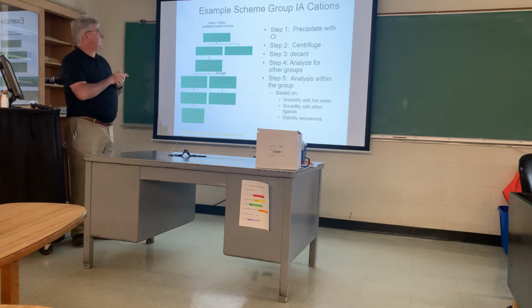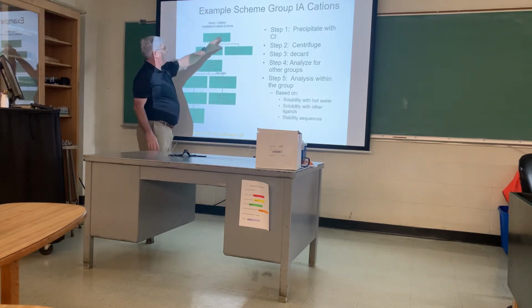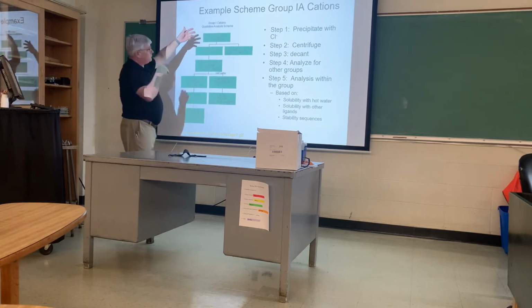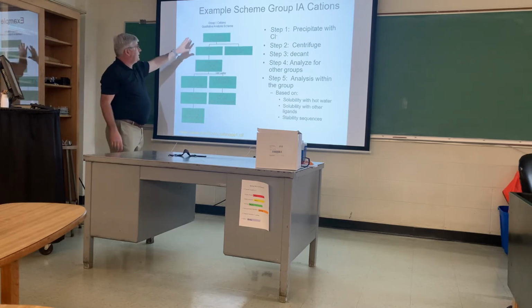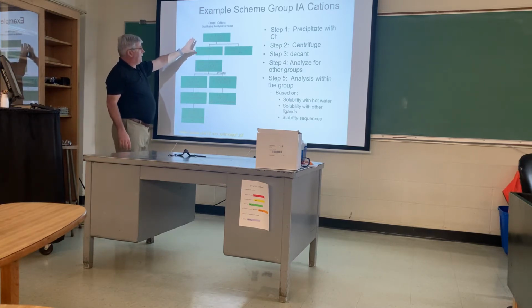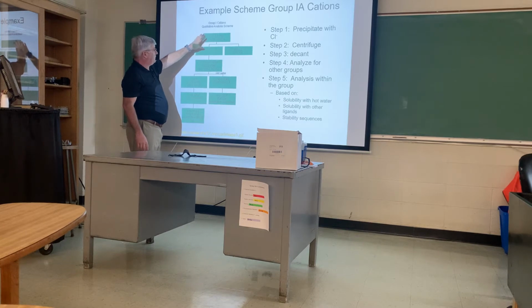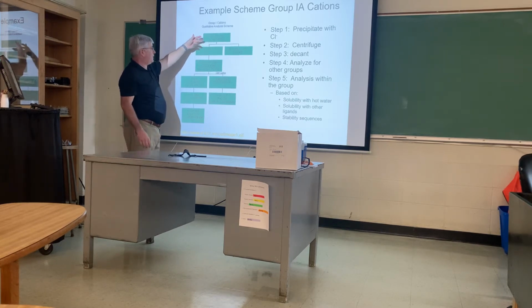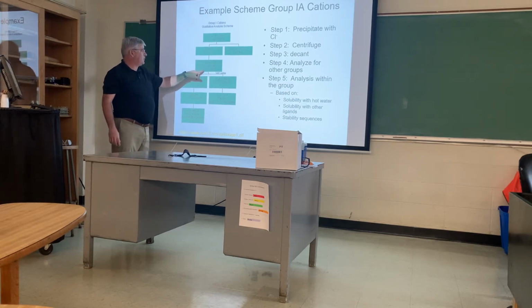This is a separation of some of the ions that we're using, actually silver and lead, and then the mercury ion. This is a group 1A cation separation. And to do this, we do wet chemistry. If I add HCl to this group, they precipitate as a solid, and then we can centrifuge, and any of those could be present.